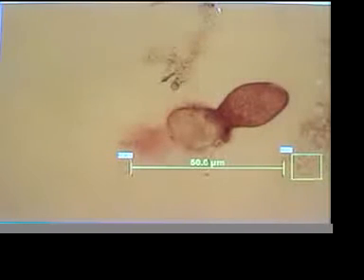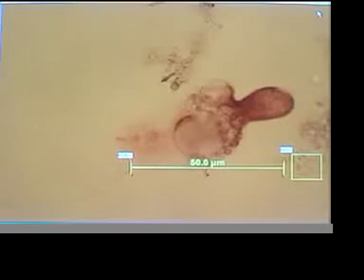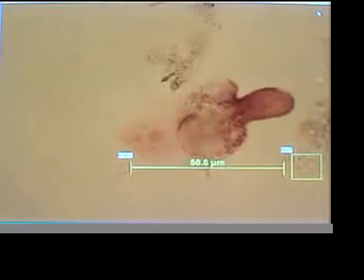We can still see the end of the devitalization. It's happening at a very nice speed for photography here. Fascinating, the way this is happening. Let's watch carefully. Sometimes a new organism is formed and swims away. I don't know if that'll happen. Let's see. He is completely disintegrated.